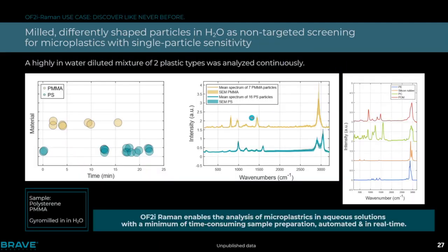We were first looking at what kind of certified reference materials are out there, and we noticed there's not as much as we thought, with different polymers, different sizes, and different concentration particle systems, where we can basically define our system and give a clear performance qualification.